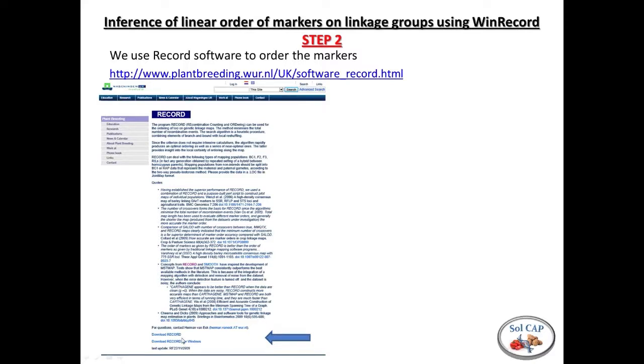There's Record for DOS, and this is Record for Windows. They do the exact same thing, except Windows, of course, has a shell type program. Today I'm going to talk about the Record for Windows. And there's a couple differences between the two programs, which I'll highlight.